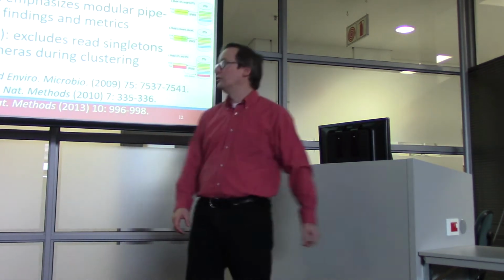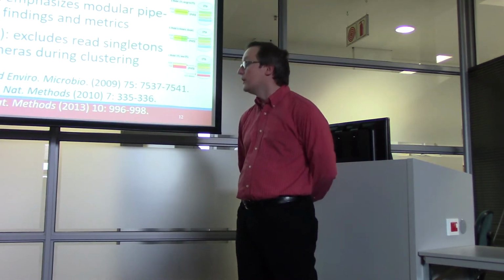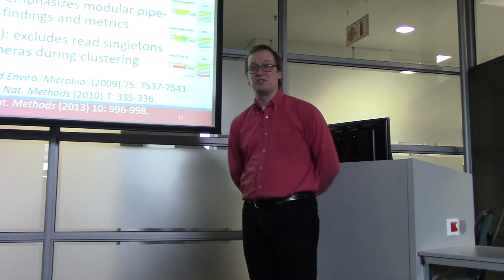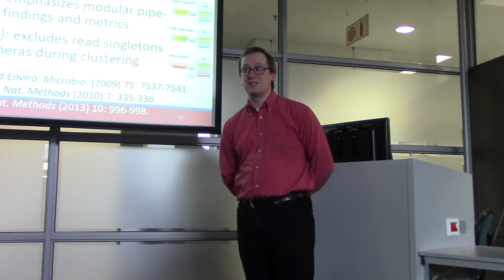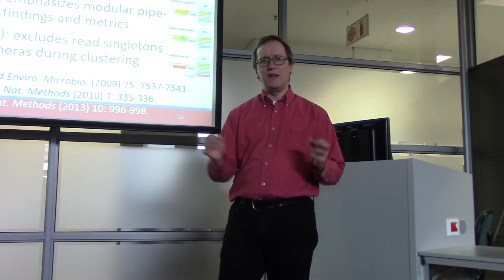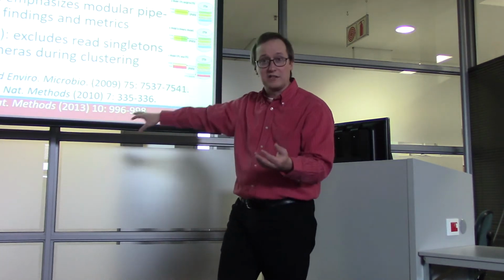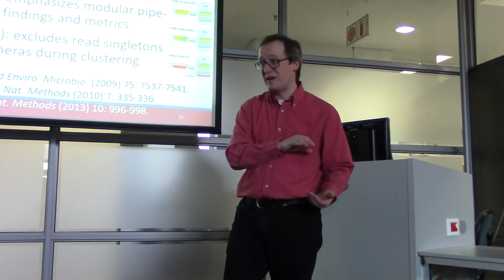But how do we get to OTUs? So there are a fair number of tools out there for translating your sequencing reads into OTUs. And I'm going to talk about just these 3 for now, and we'll also look at the databases we use. So I want you to think of this as 2 parts. One is that we have the algorithms that are operating on the sequences that are doing the lookups and so on, and that's what we're looking at in this slide. In the next slide, we'll be talking about the reference sequences against which we will compare.